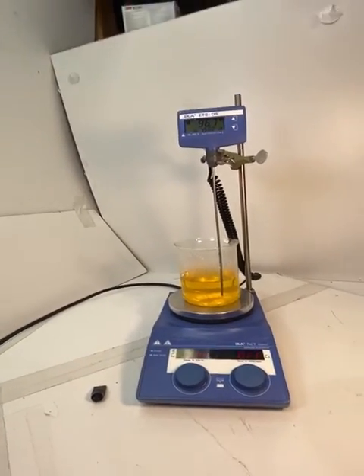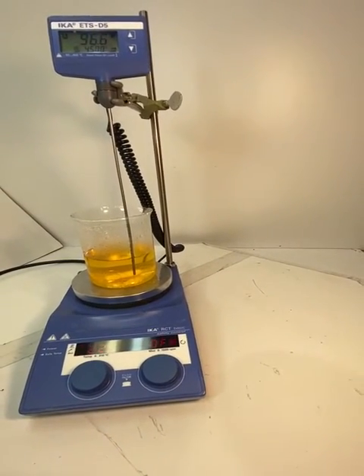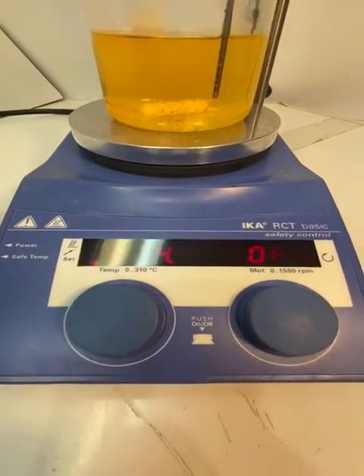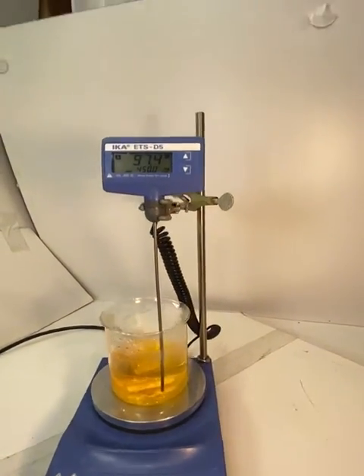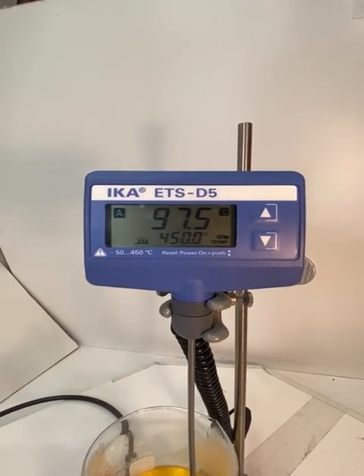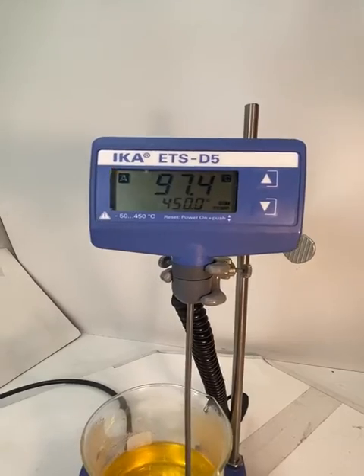Hello everyone, this is Nanoplating. Here we have an IKEA RCT Basic Safety Control Hotplate equipped with an IKEA ETS-D5 Temperature Controller, or Programmable Temperature Probe.